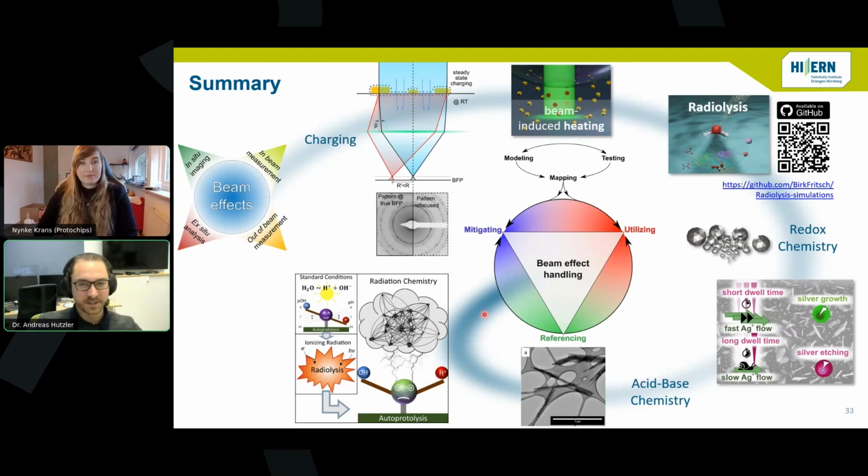Yeah, so the energy of the primary beam, or the energy of primary electrons, is transferred via inelastic scattering. So the primary electrons lose some of their energy, transfer their energy to the liquid, and this excites the water molecules or ionizes the water molecules to induce this radiolysis.